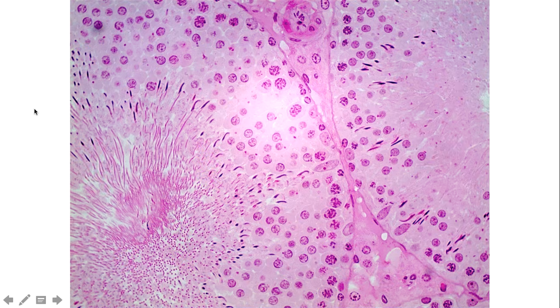For the males, we have three slides for you. You have the testis, you have the epididymis, and you have the penis. And so this slide is going to be familiar from lecture. This is the testis. And what we can see here within the testis are two seminiferous tubules.